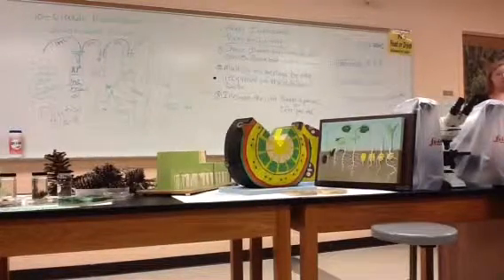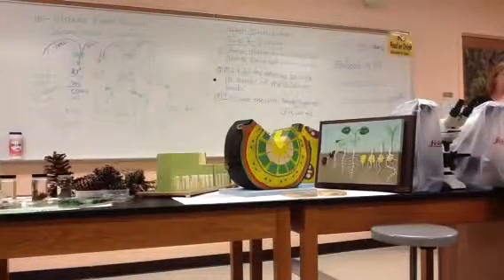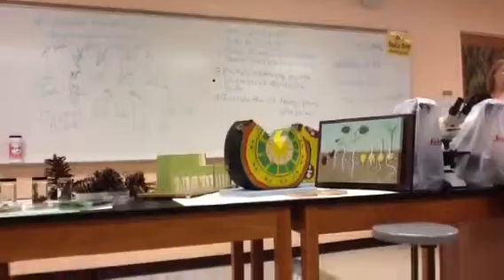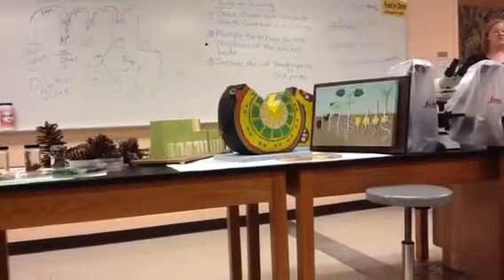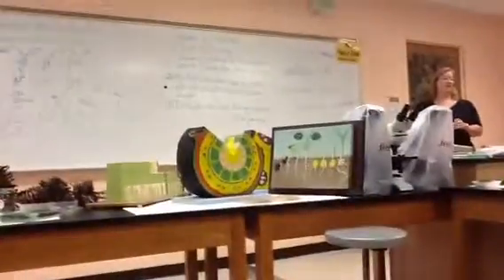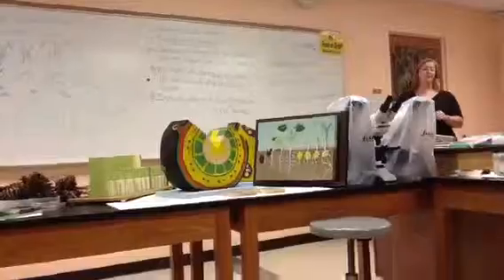No, like you're seeing on your tubes, they tend to get bigger when they're more diluted because they've got more space to spread out. In tube 1, you've got so many bacteria there that are crowding each other, so they stayed small. But by the time you get to the 3rd plate, they have so much space that they can be bigger. So they tend to get bigger as they have more space to move into.